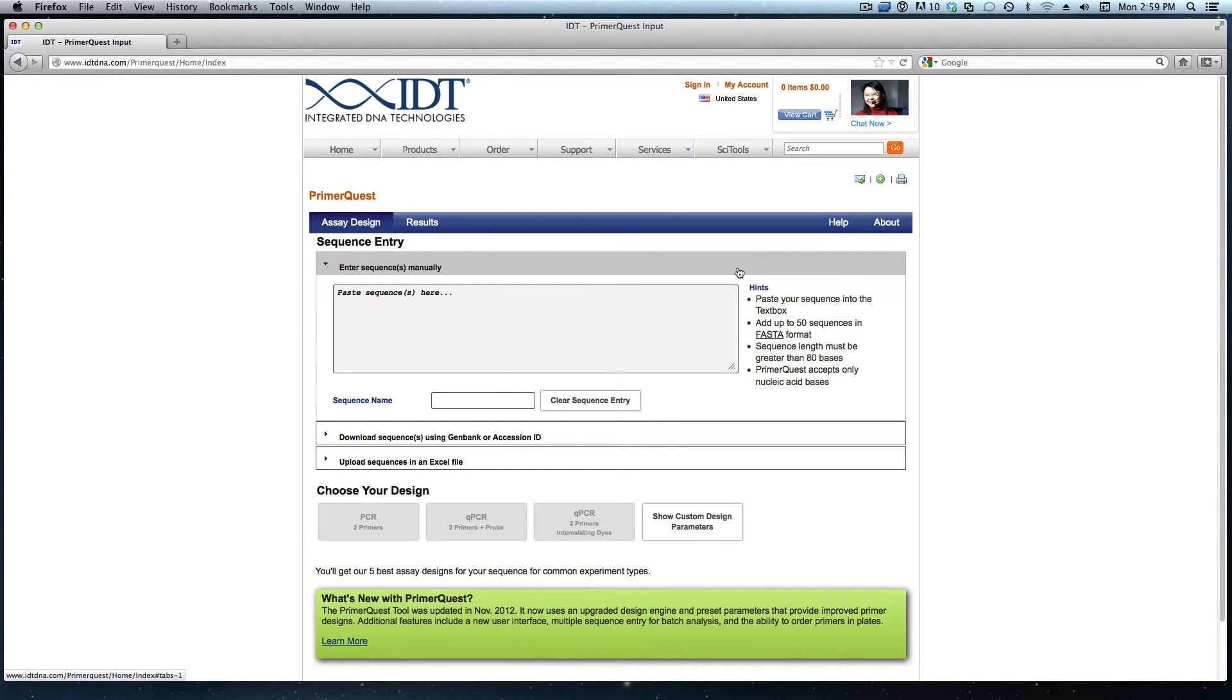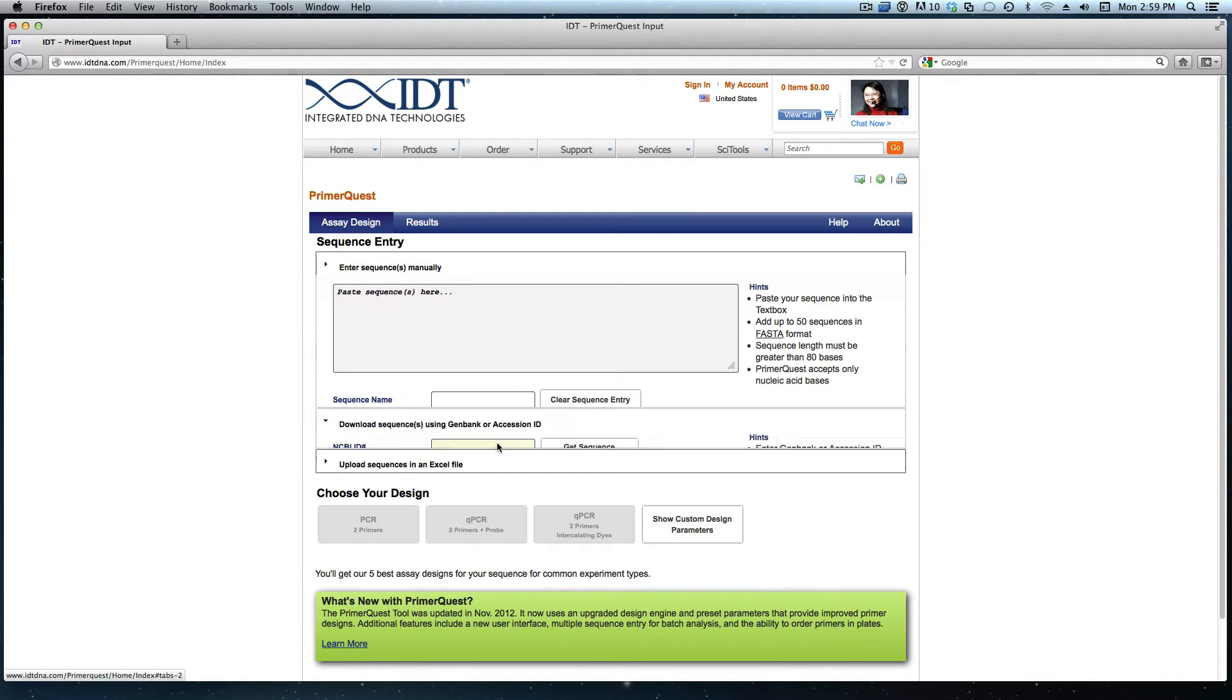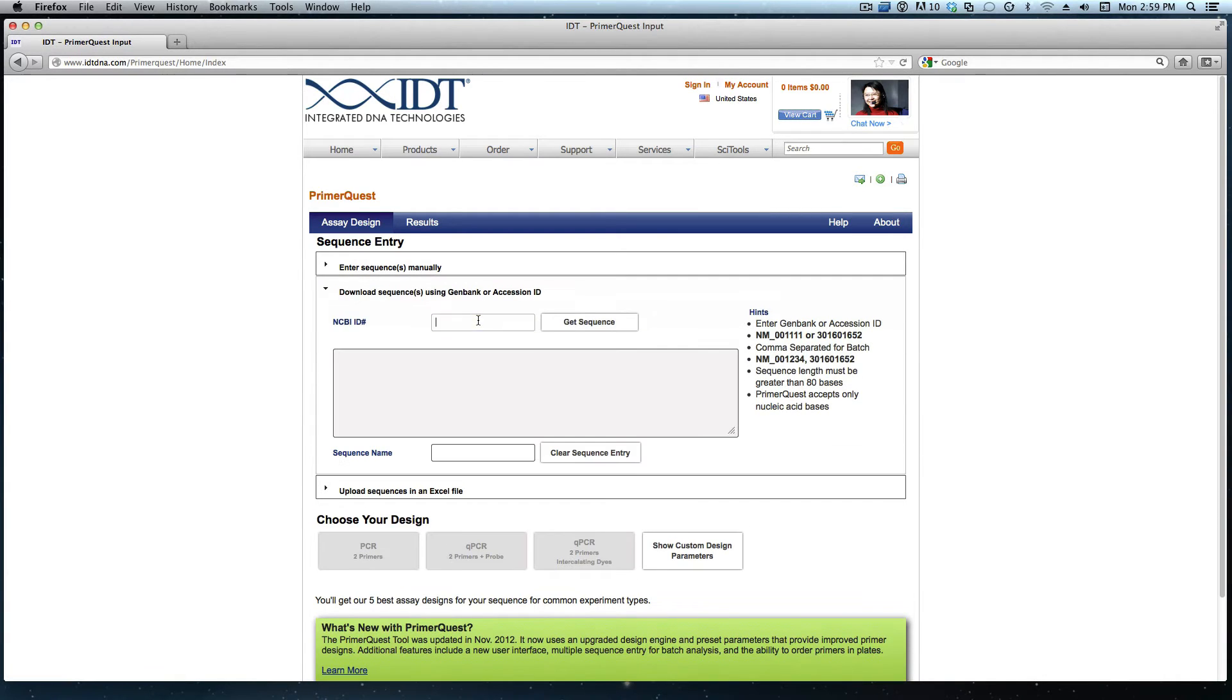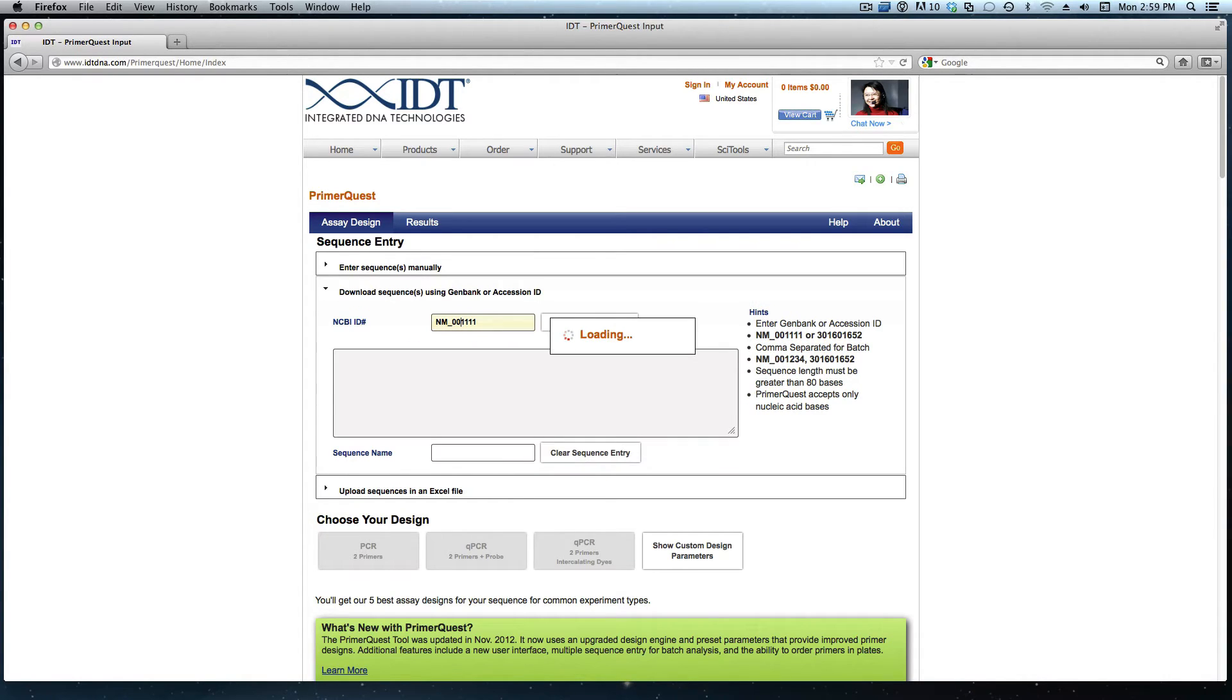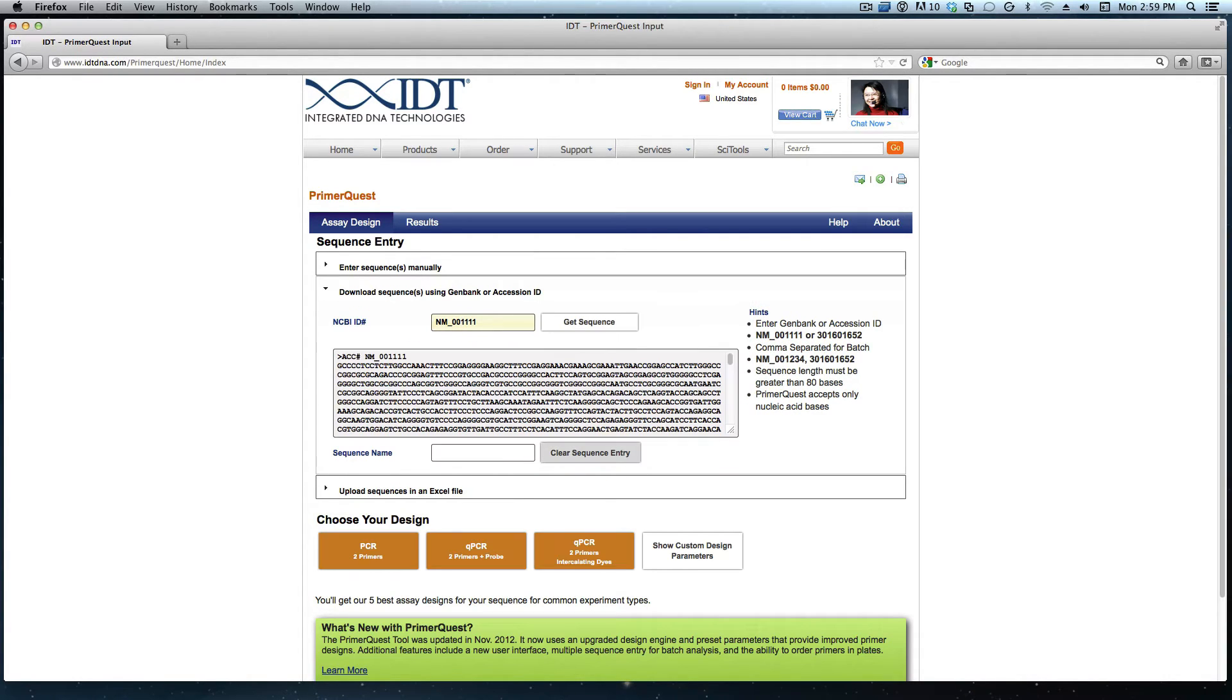Once I get to this page I need to enter the sequence that I would like to design against. I will type in the accession number that I am currently interested in. Hitting enter or clicking get sequence will allow that sequence to populate in the sequence box.